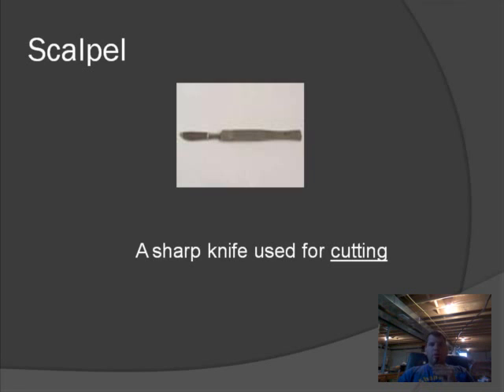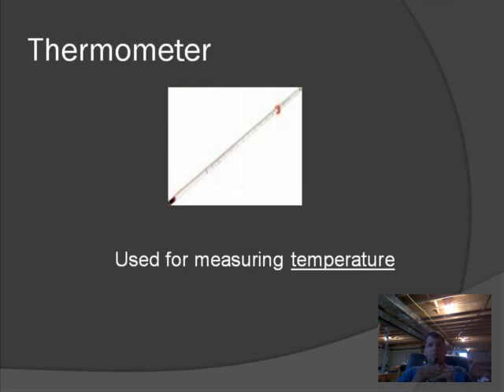The next tool is called the scalpel — it's basically a knife used to cut things. Obviously common sense tells you to be careful because of the sharp blade. Our thermometers are used to measure temperature. Ours are glass and alcohol-based, so if one breaks, it's okay — it's not like mercury. Mercury thermometers aren't found much anymore. Ours are alcohol-based and perfectly safe, but we use them to measure temperatures.